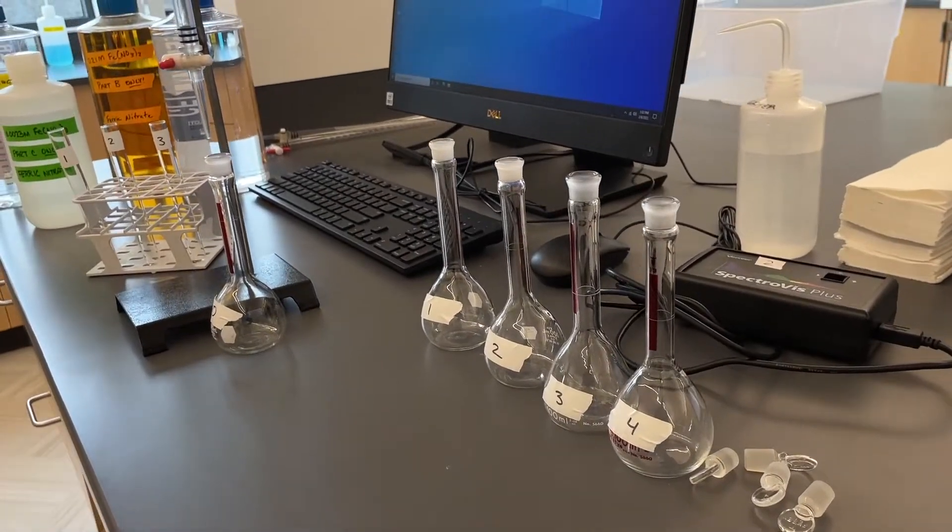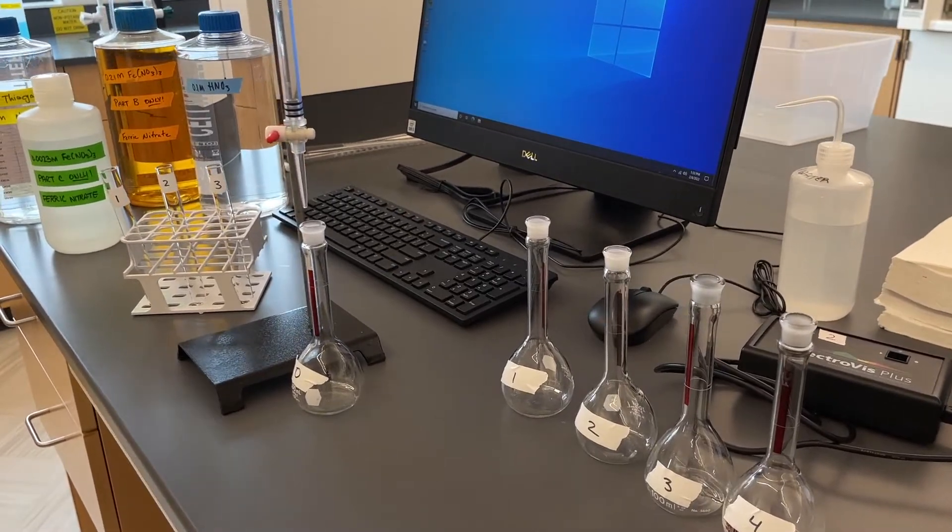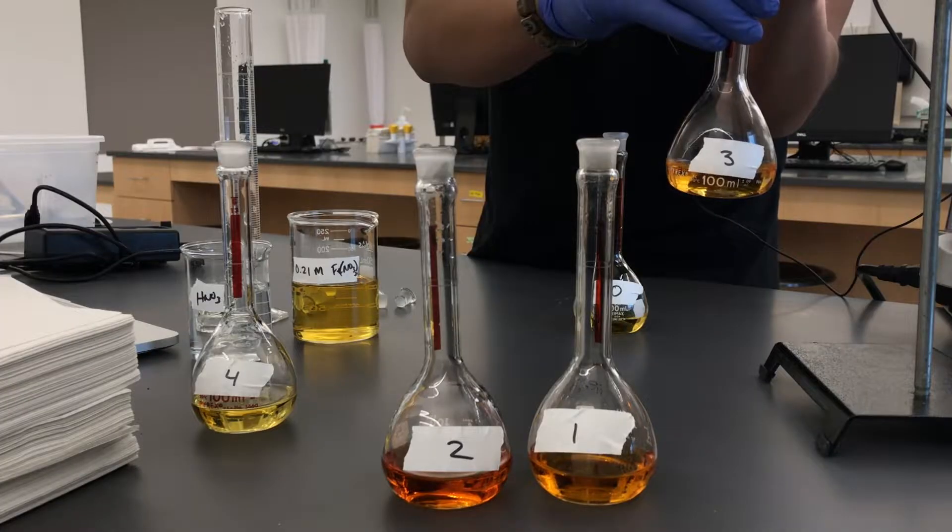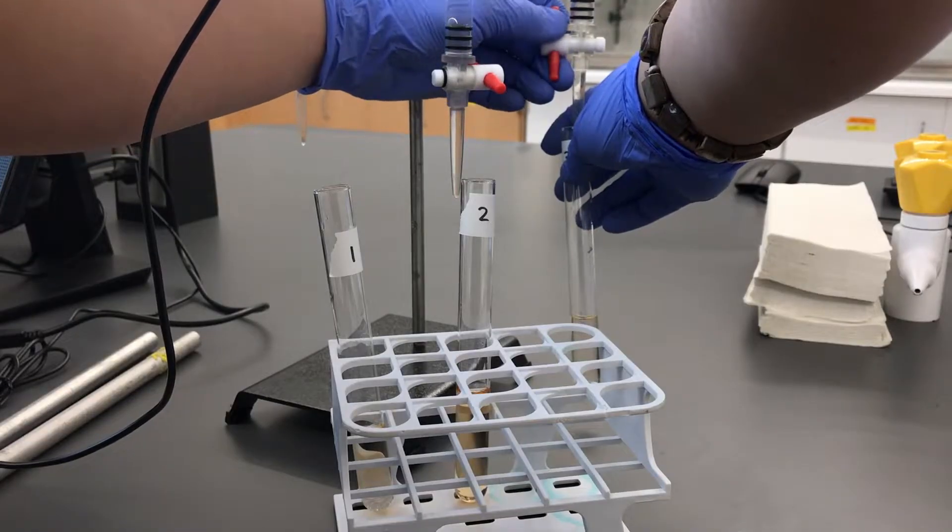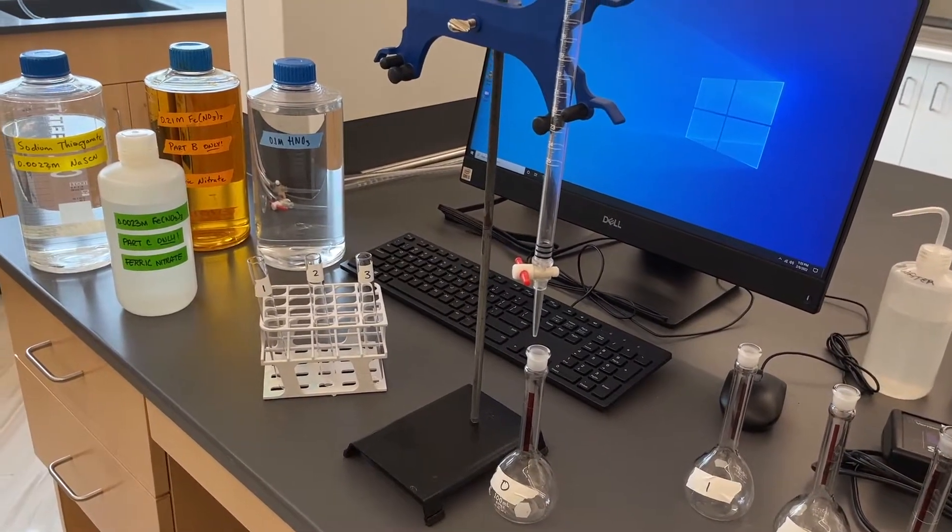In this laboratory demonstration, we'll see how to determine the equilibrium constant for an iron-3 complex reaction by making some standard solutions to create a Beer's Law plot and then identifying the concentration of the reagents that are needed to form the reaction at equilibrium. Let's get started.